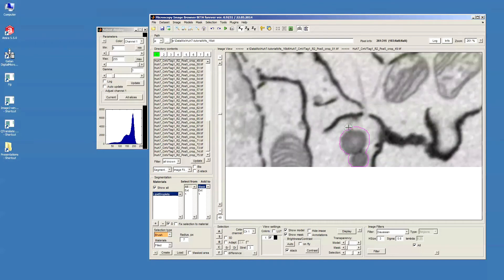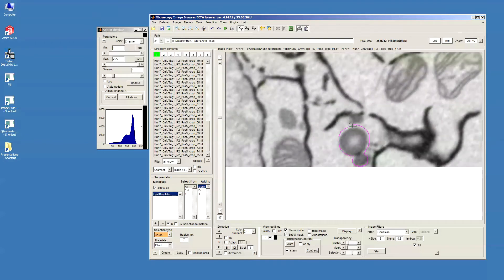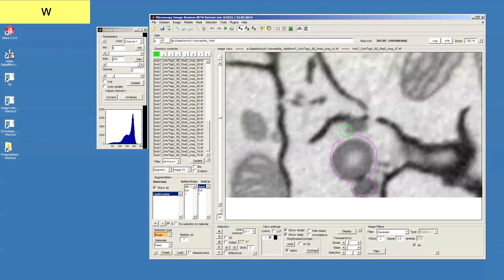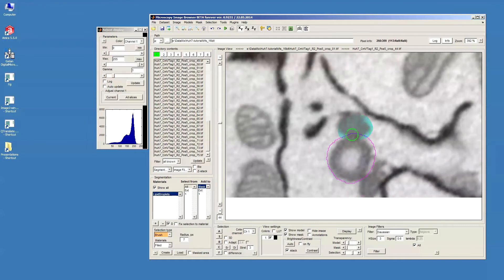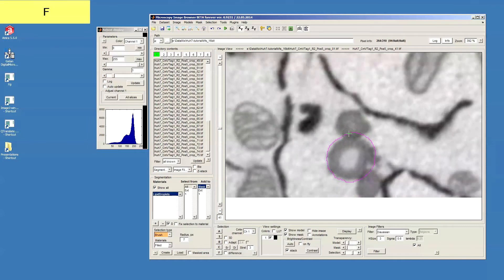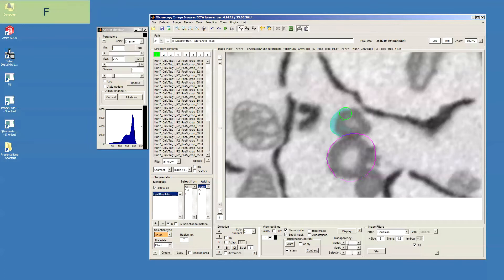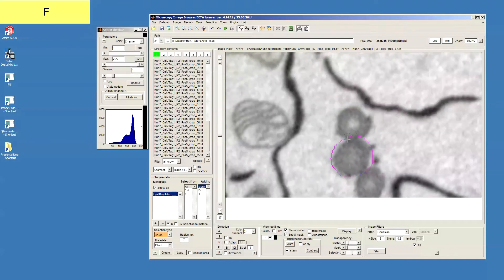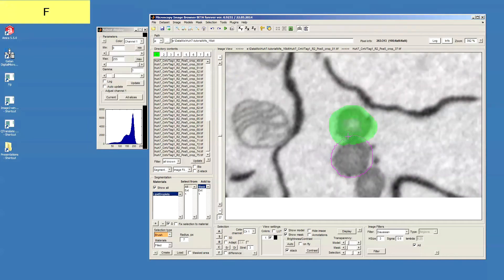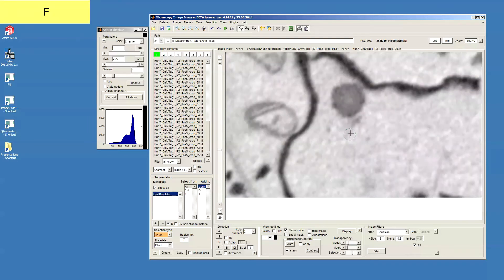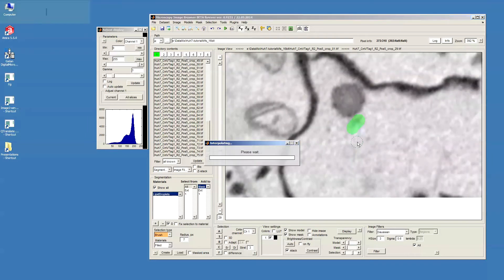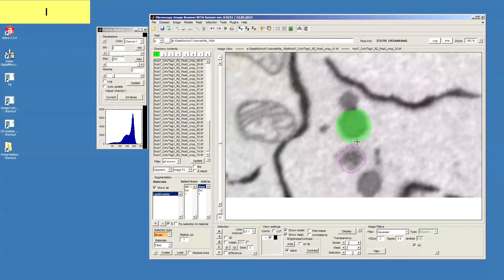Okay, there is another one here. So we can just do this similar selection. Okay, press I to interpolate.